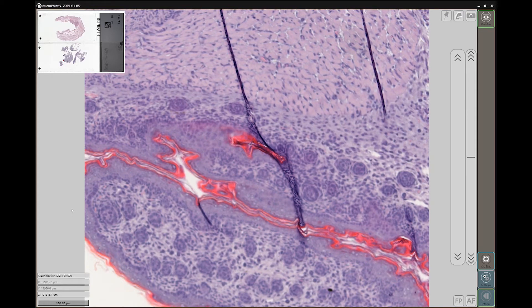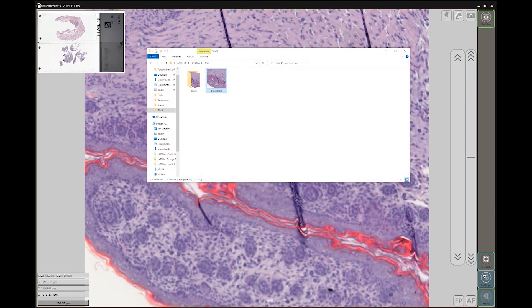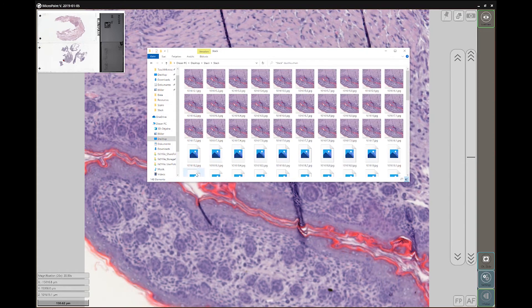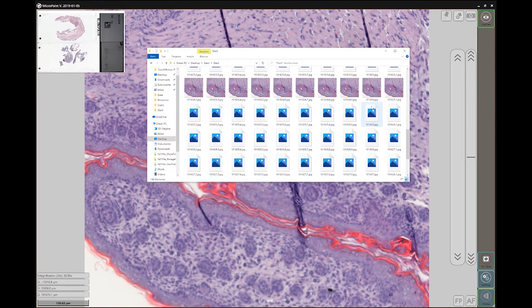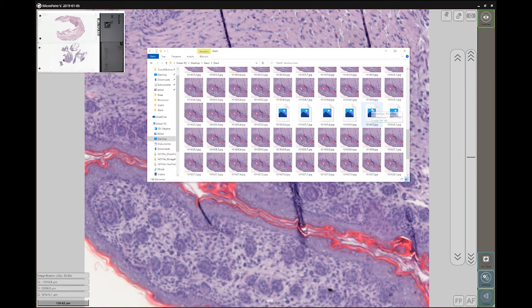Let's open up our folder again, and there is a folder where all the pictures are being taken throughout the Z position. Small note: there are so many images because we selected the minimum travel range.